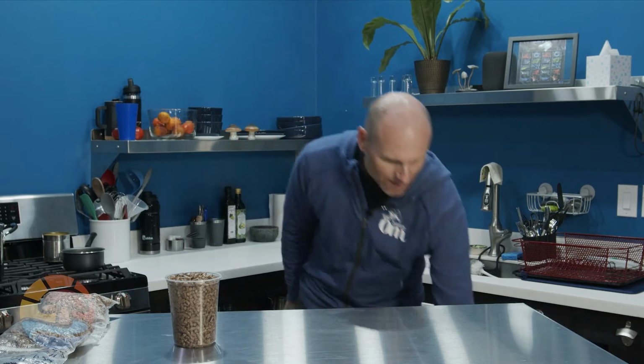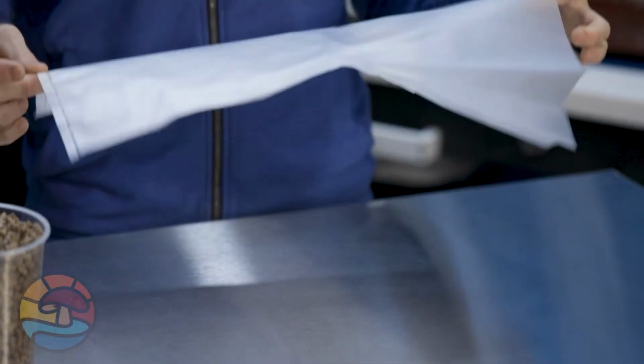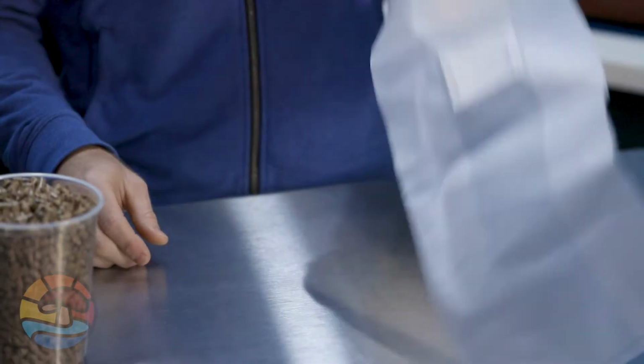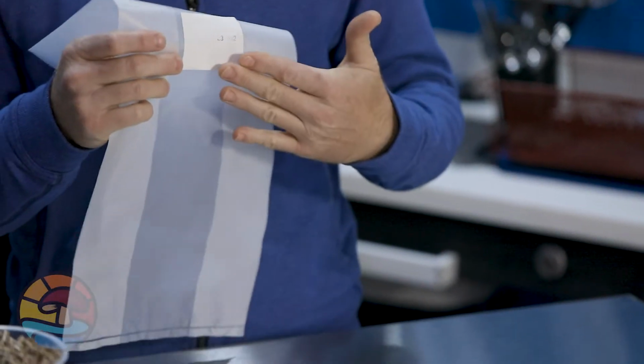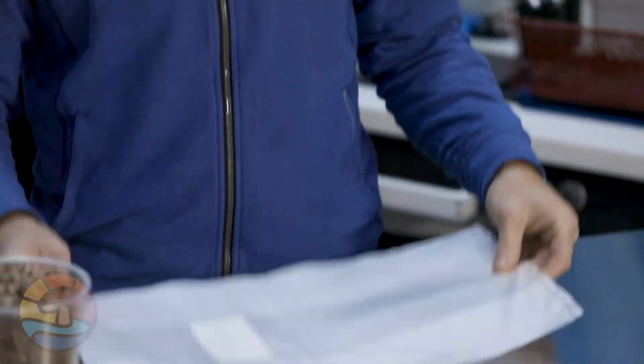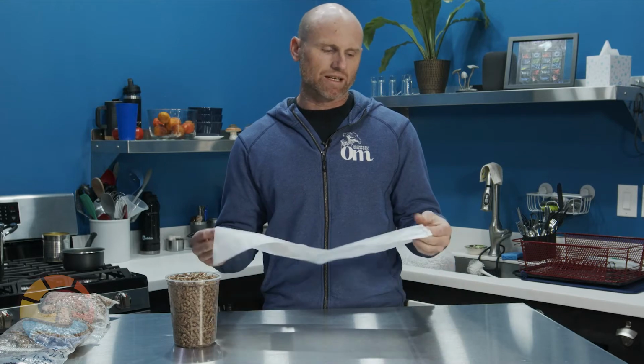So the first thing we're going to do is we're going to take a bag. In this case, I recommend using an HDPE bag or a polypropylene bag because they both can sustain high temperatures. This is a myco bag. This has a filter patch on it, and in the mushroom industry we use these to sterilize substrates in an autoclave, so they can withstand up to about 260 degrees or so.